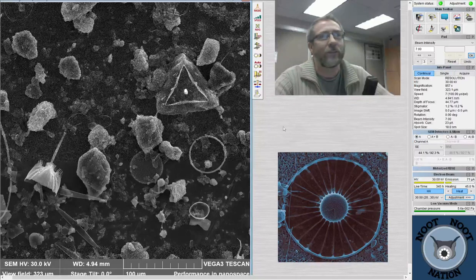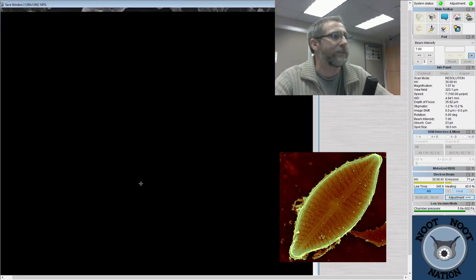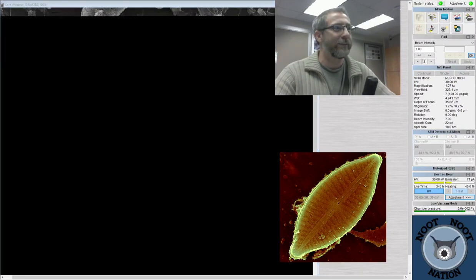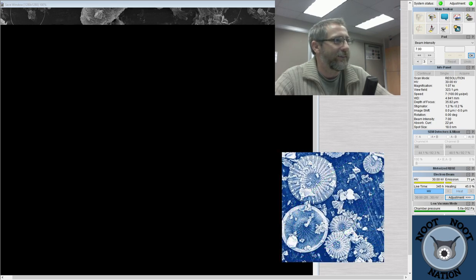So I'm going to slow the speed to 7, set the beam intensity to 7, and take a picture so that I can hop back over to chat and say hello again. So let's see.